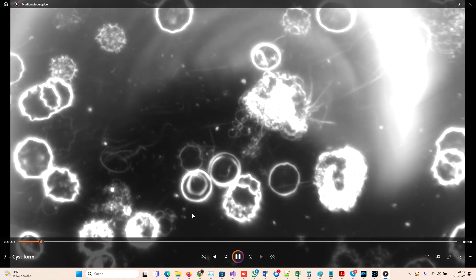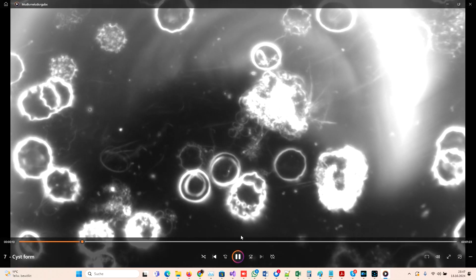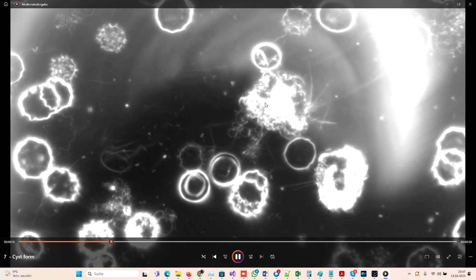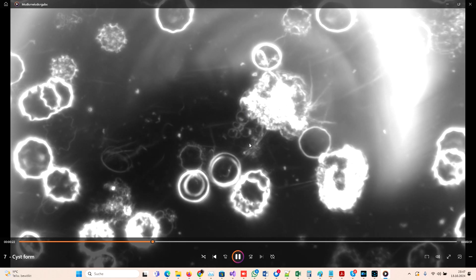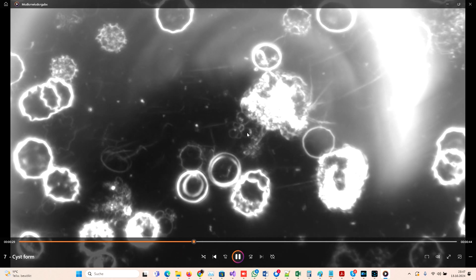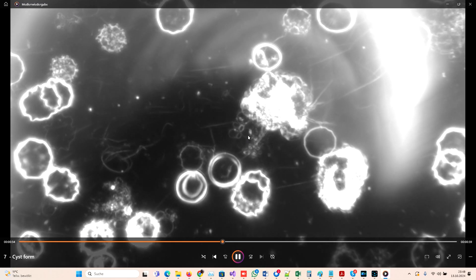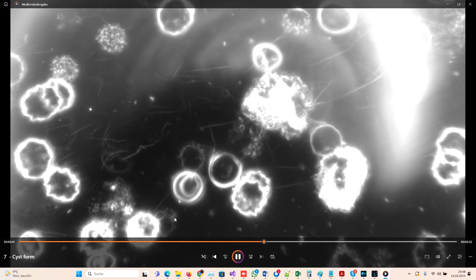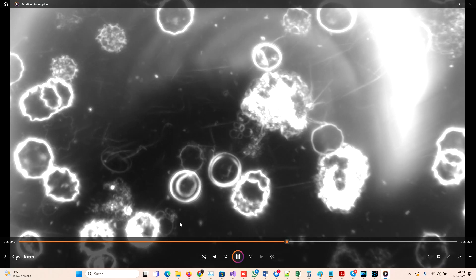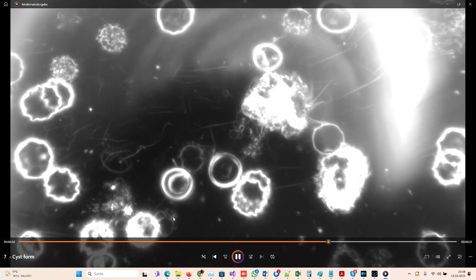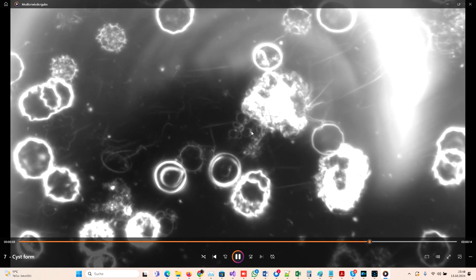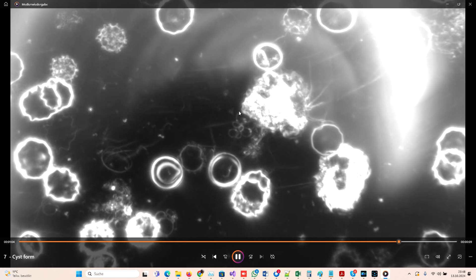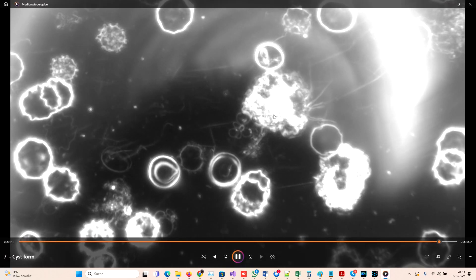I suspect in this video we are seeing two things: the cell wall deficient form of Lyme and the cyst form of Lyme. This blood sample is also from a Lyme patient. I believe that those kind of things here are the cell wall deficient form of Lyme. We are seeing here the rings and we are seeing here also the cysts. Here the same. If I change a little bit the settings of the scope, like I do now, I see those dots here and they are indicating the cyst forms. That's why I guess we are having here the cell wall deficient form and the cyst form. This is a dead white blood cell here.